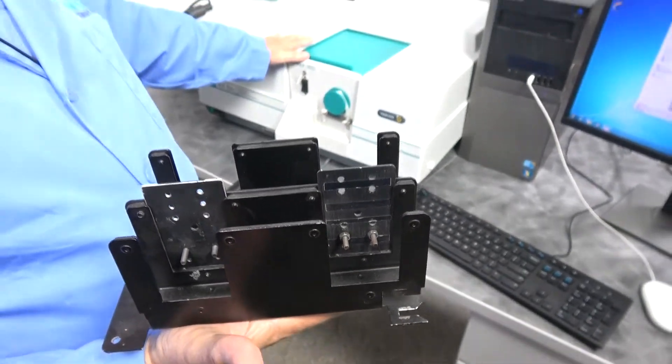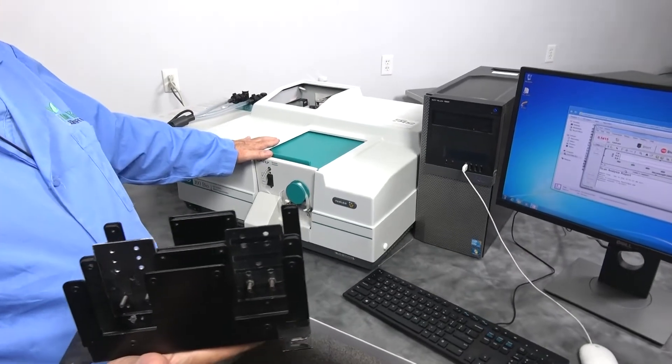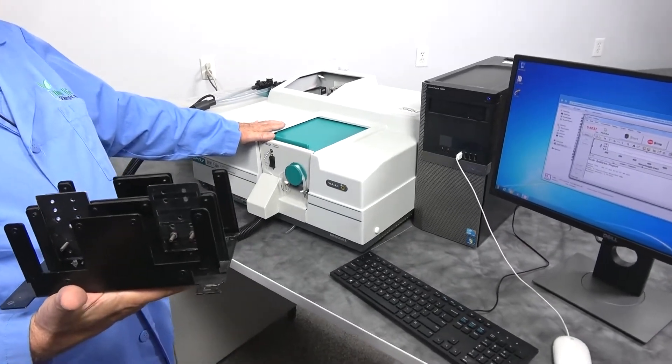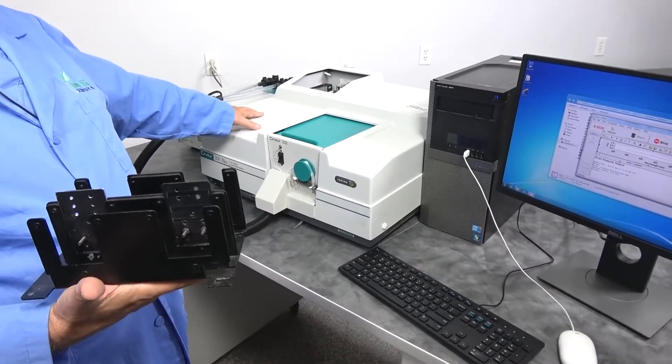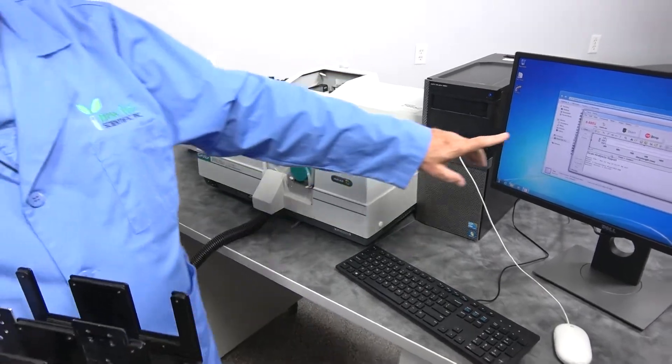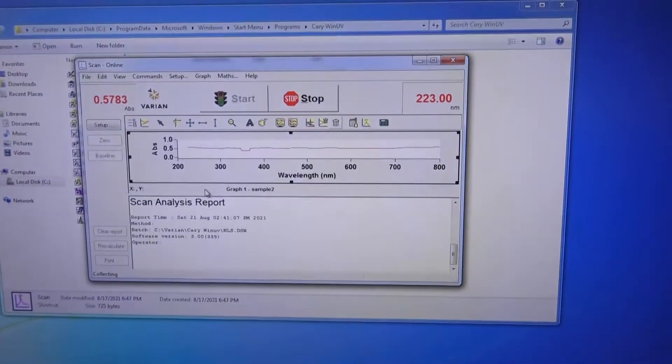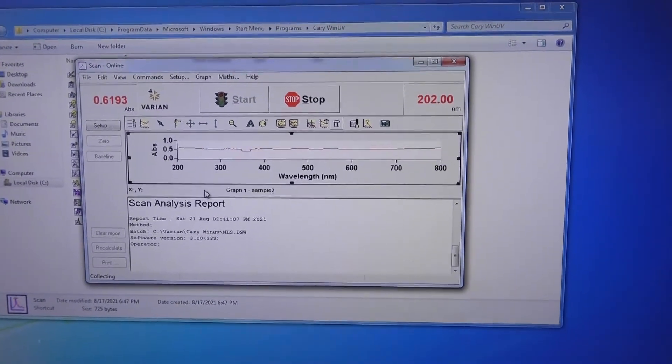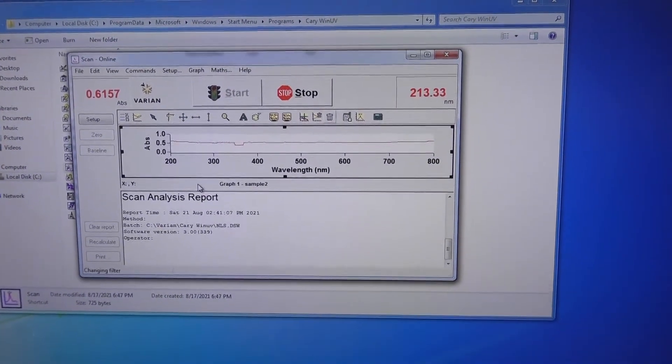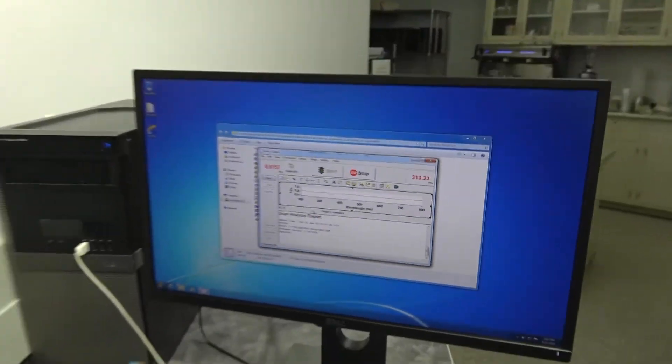That click, as you heard, was the unit changing over to the UV lamp. And as you can see, it's wanting sampling. And then it'll finish up and it'll do the rest of the program.